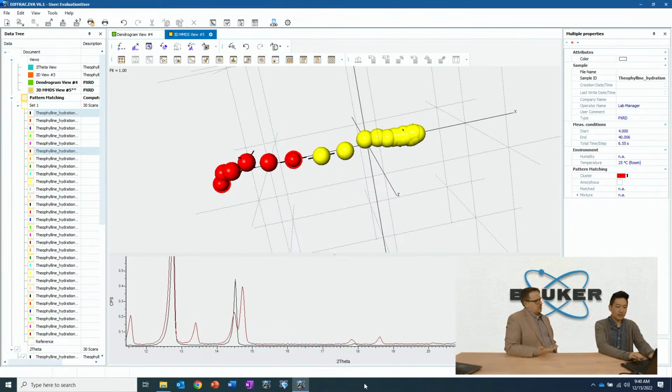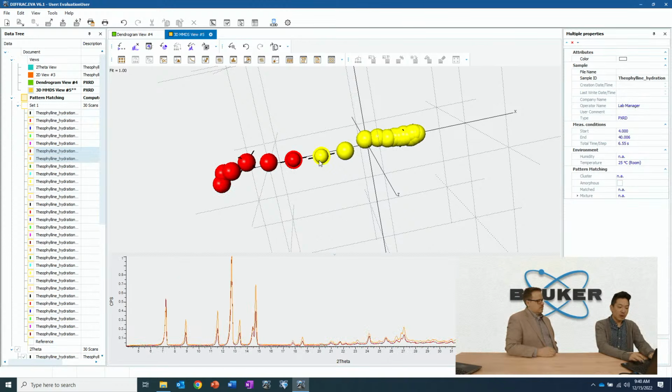And kind of expected in this data set where it's hydrating. And you can look at, say, the 2 middle ones that are very close to each other, and we've decided that this one looks more like red and this one looks more like the yellow family. But these 2 are probably more related to each other than they are to the clump in between. Right. And this has nothing to do with databases and things like this. We've just done no similarity of a pattern to another. Similarities of patterns only. And so this has been kind of cool to look at.